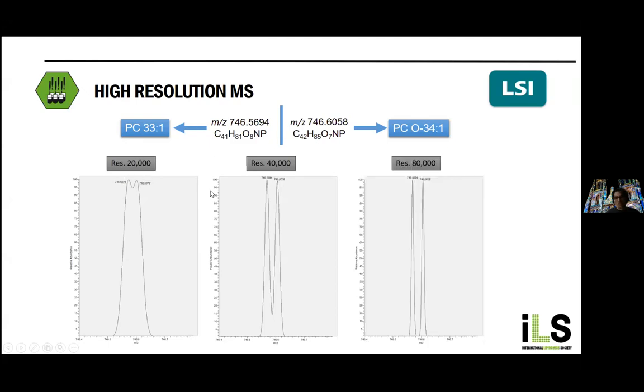And therefore we need that type of assumption if we annotate our low resolution mass spectra, because you see we cannot with the triple quad, which has unit mass resolution, which means it could differentiate 746 from 747 easily, but not that type of small mass difference.